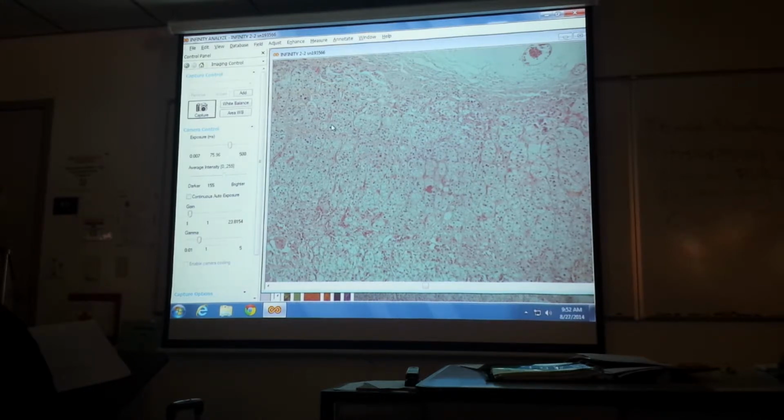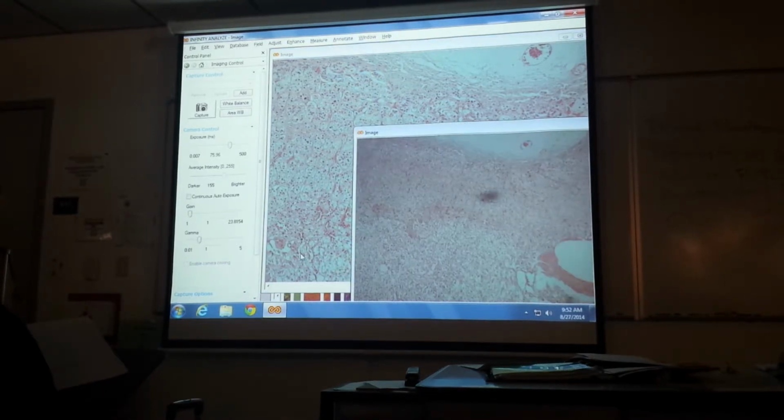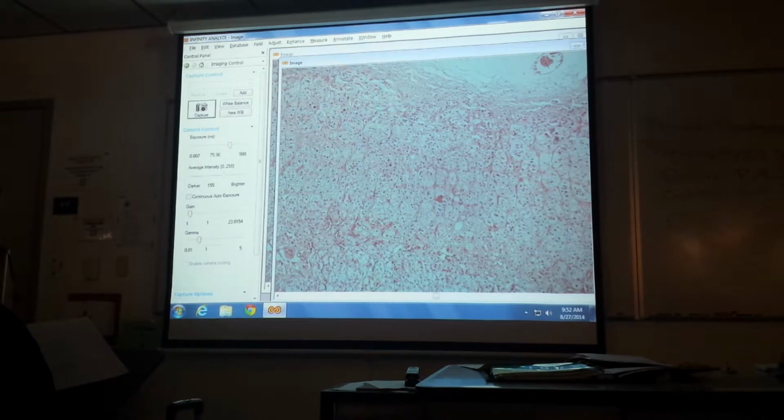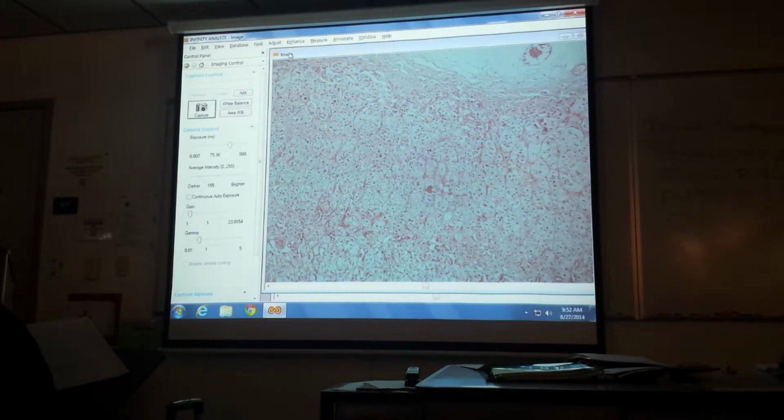I'll take a picture of this. I'll see if I can find a better spot in the slide. All right.